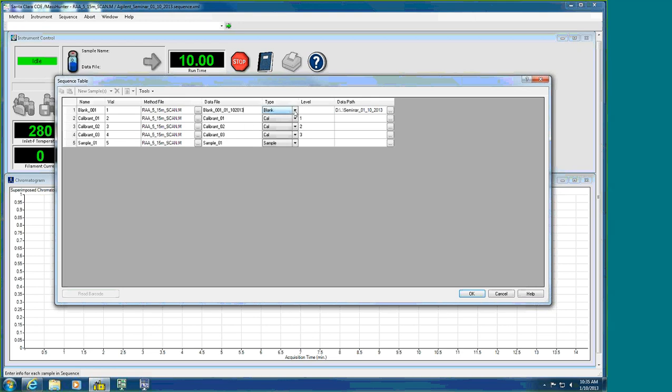But another important thing to take a look at here is that now I could go ahead and say what sample types I have, and if I want to do quantitation later on, this particular field here will go with the data files in terms of is it a blank, a calibrant, or a sample, and it will make my quantitation easier. We will go through that in our latest series when we go through MassHunter quantitative analysis. But doing the work up front saves you a lot of time when you want to quantitate. It makes things a lot easier, and it just takes an extra click here.